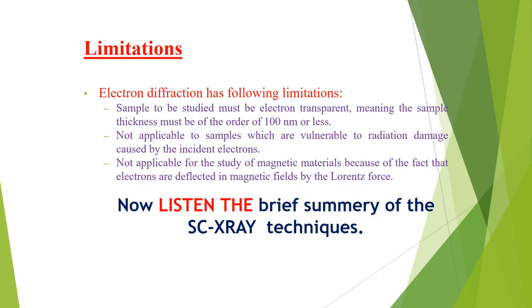The intensities of the diffracted beams include displacement parameters, site occupancy factor, atom types, and position. The connection between the lattice and the diffraction pattern is a reciprocal one: a crystal with a more compact lattice results in a wide diffraction pattern, while a large lattice structure gives a compact diffraction pattern.